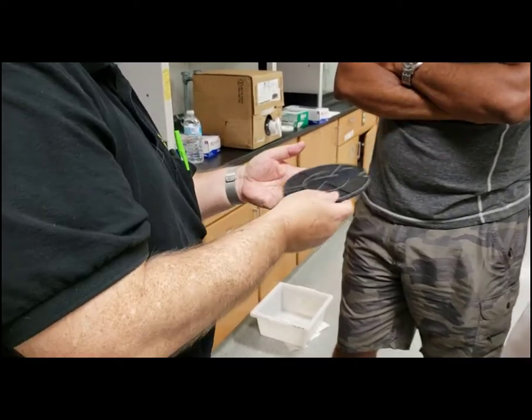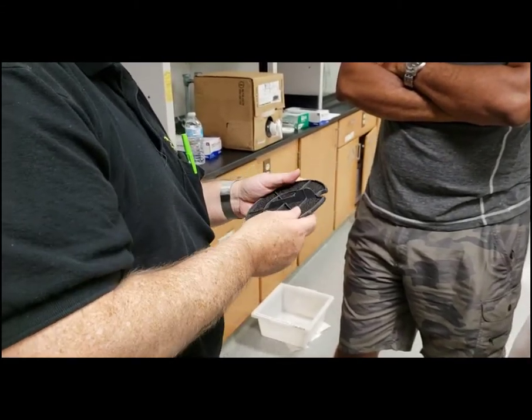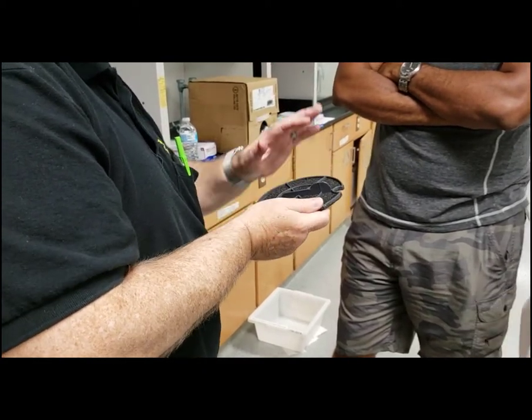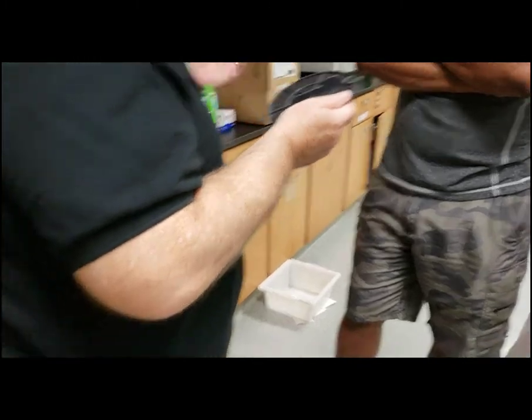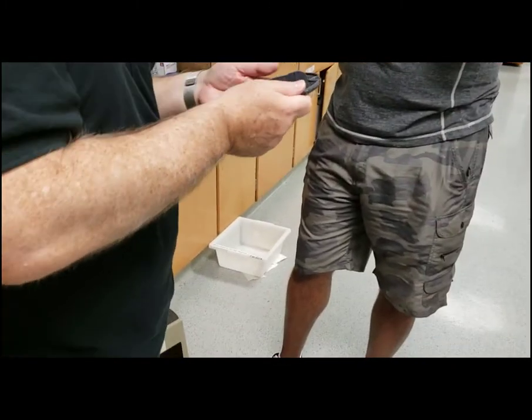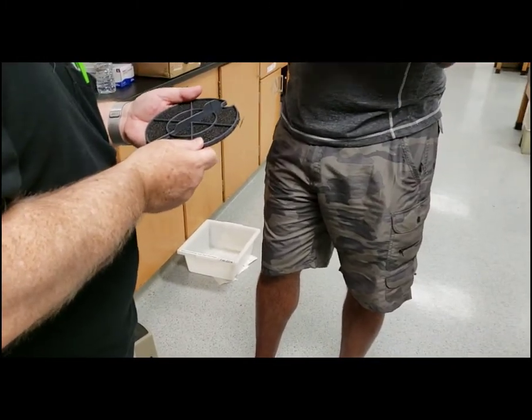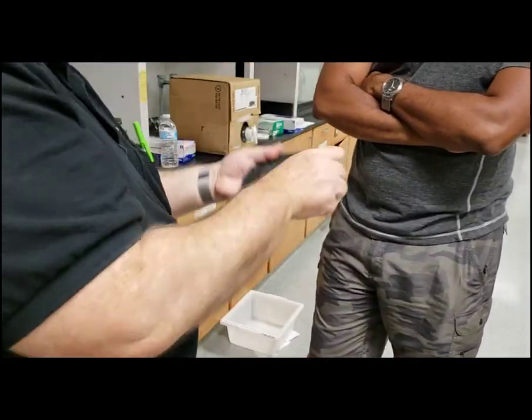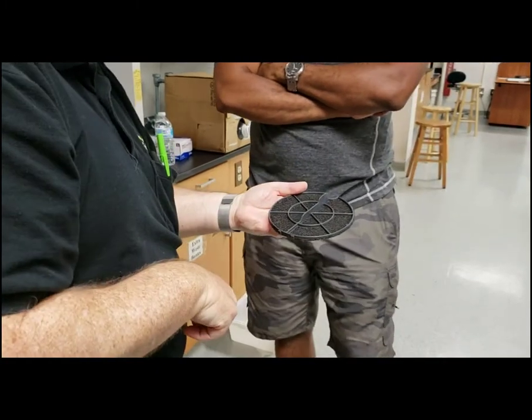Or you can take it to the sink with mild soap and water, but it has to dry overnight because you don't want to be sucking moisture into the instrument, because that's not good. But if you use a vacuum a lot, it wouldn't take out some of the... No, it's very porous. So a shop vac works really well.